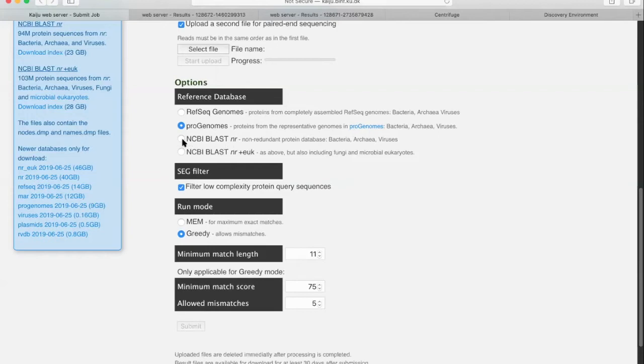This third database is the NCBI non-redundant database. The difference between using NR and, let's say, RefSeq is, first of all, it's not curated, so the results are not as reliable. And the second thing is it has a lot of unclassified environmental samples. And so you're very likely to get environmental samples as one of your main results, which is not very useful.